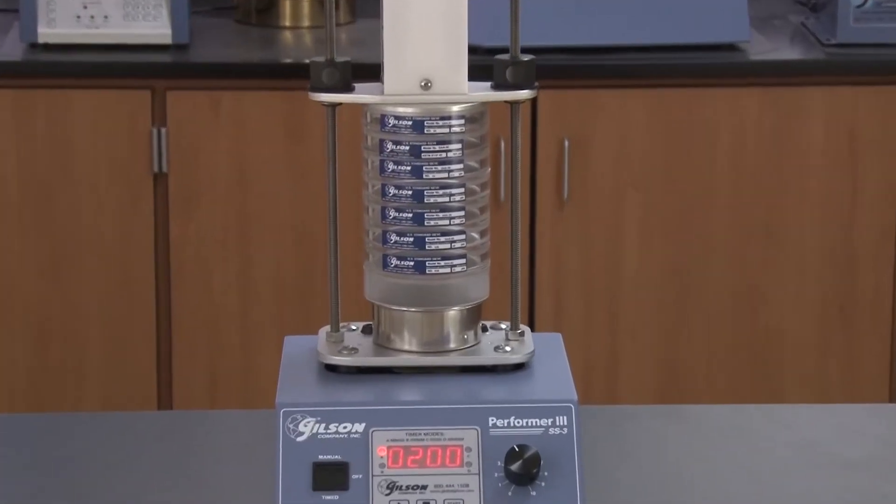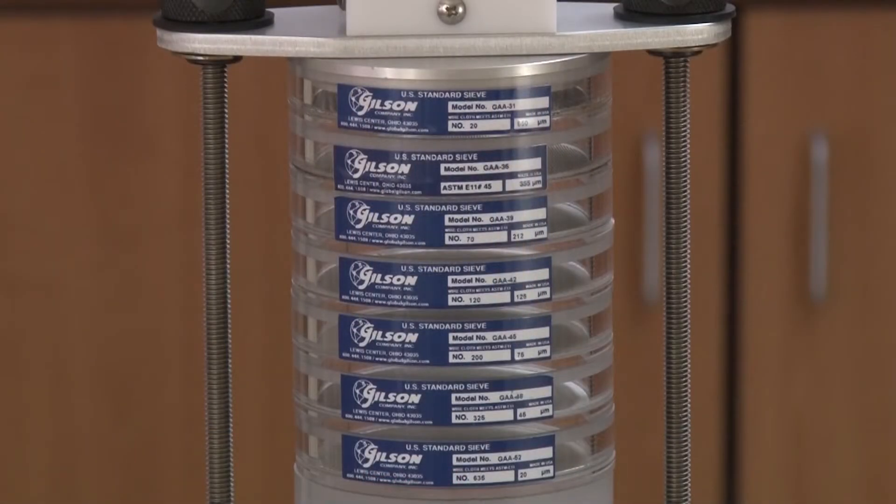The crystal clear acrylic frames are a Gilson exclusive and allow for visual monitoring of the sample during the test.